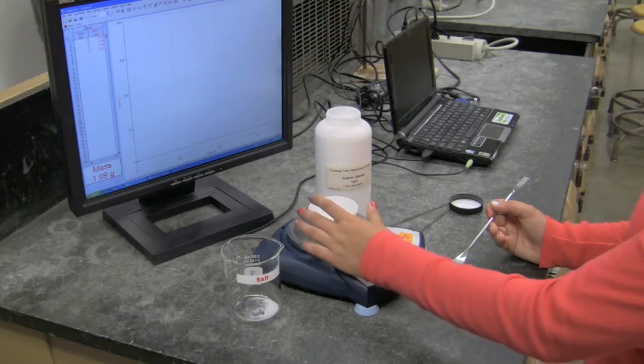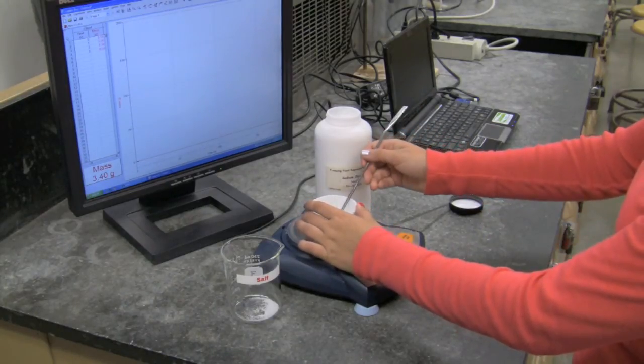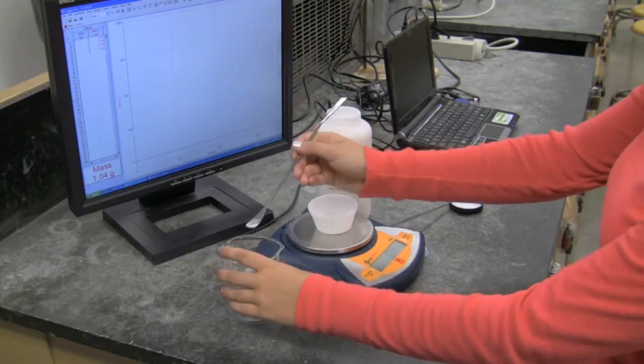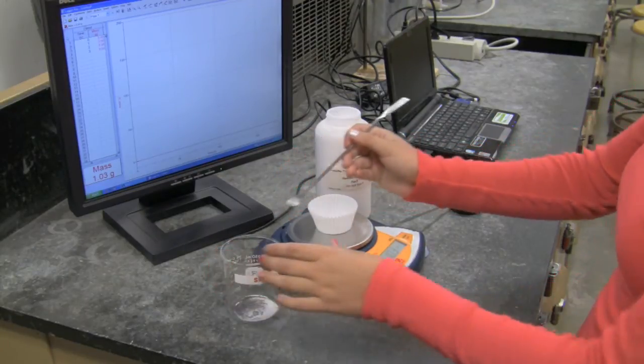The student is now scooping excess salt from the weighing boat, 2.51, and placing it in the beaker to her left.